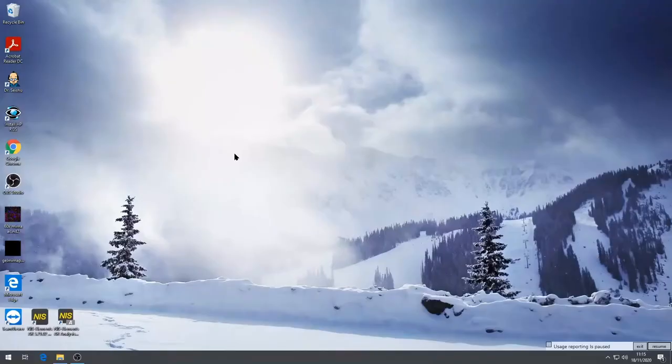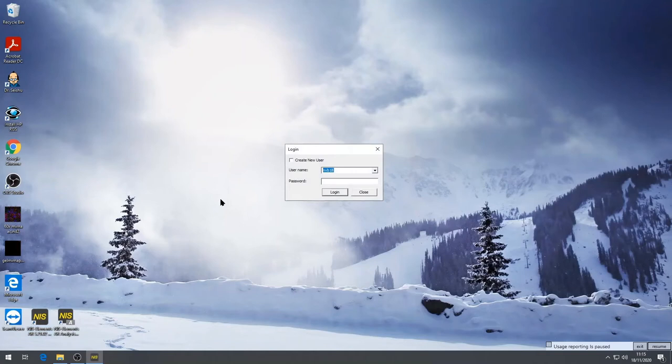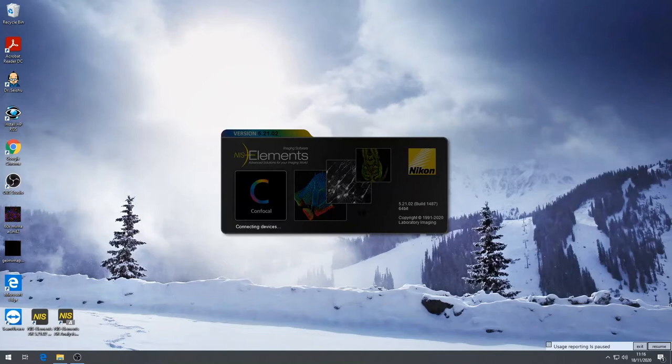Once you have the microscope all switched on, log in to the computer, register with PPMS and then start the NIS Elements program. Put your username and password in the required windows. If there is an option select Nikon A1R Confocal from the drop down menu and the microscope will initialize. Wait until the software opens up.